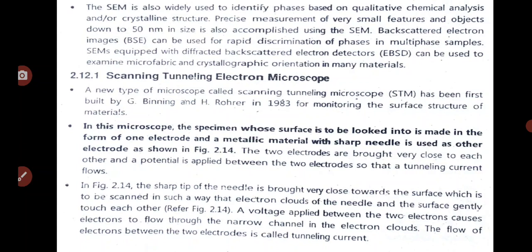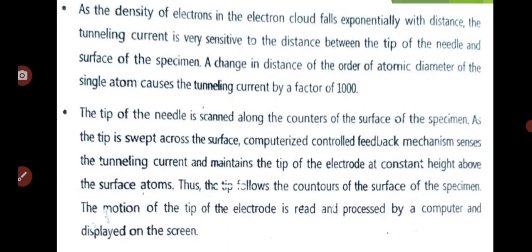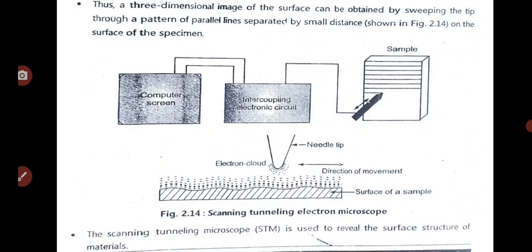The needle tip is the electrode, and below it is the surface of the sample.